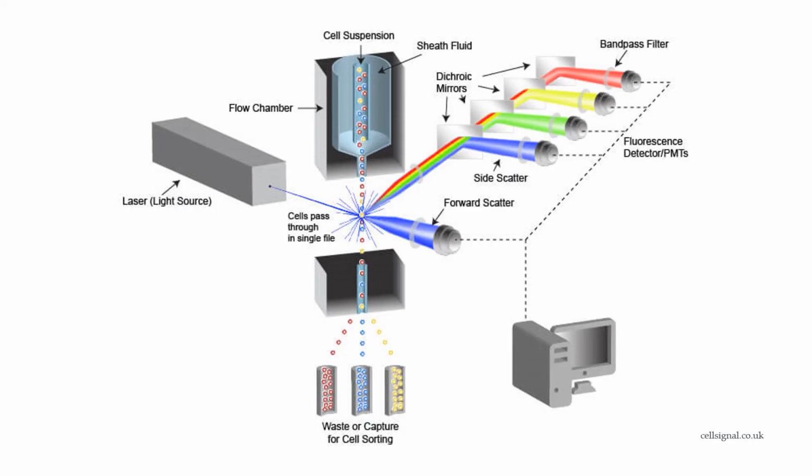The FACS machine is expensive. When I was studying, the uni even assigned a technician with a PhD to take care of it. It's expensive because it's powerfully sensitive. I'll leave links below if you really are interested in how exactly a FACS machine works. But the basic idea is, firstly, you treat your cell samples with probes, multiple probes which can detect multiple biomarkers.